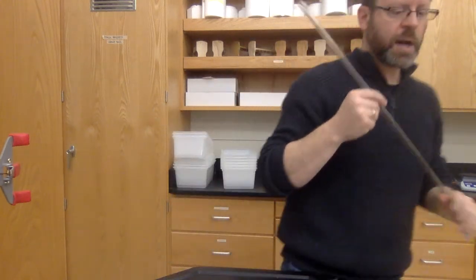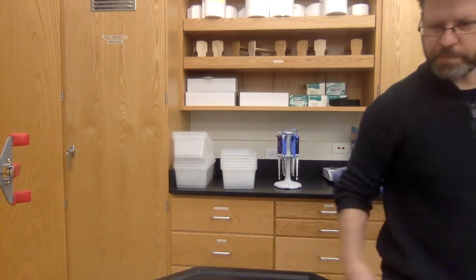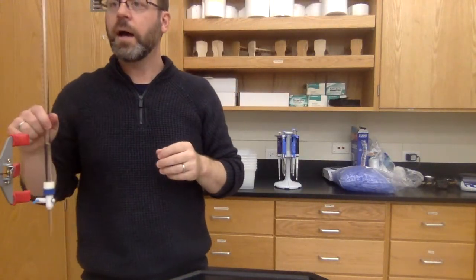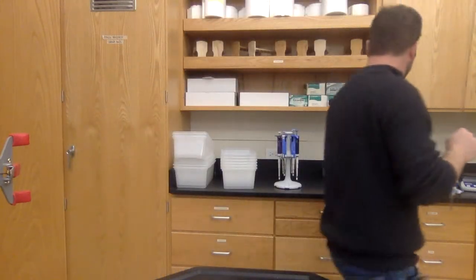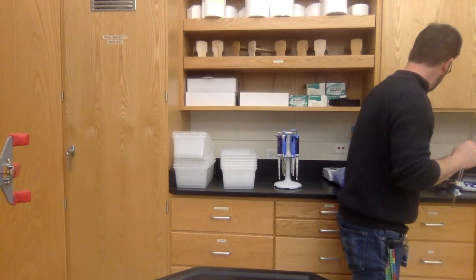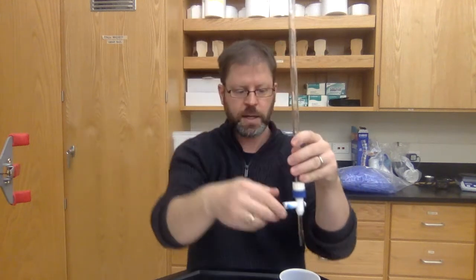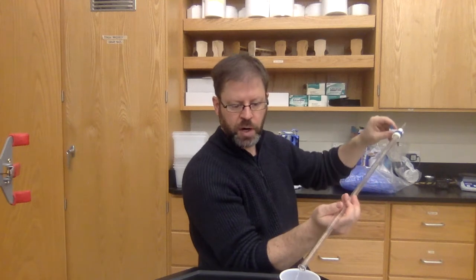So I would fill it with water, which let me just do that off screen over here. Okay, so I put a touch of water in here. You can see the height. So I'm just checking it. I see water coming through it, so I know that it works. What I can do now is I can hold it off to the side and I can pour out.